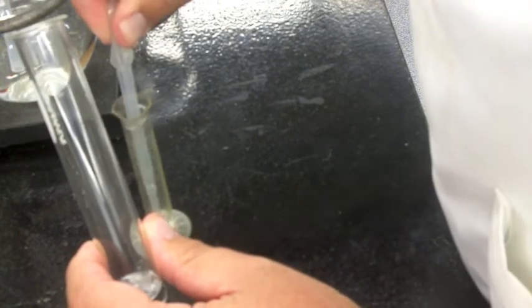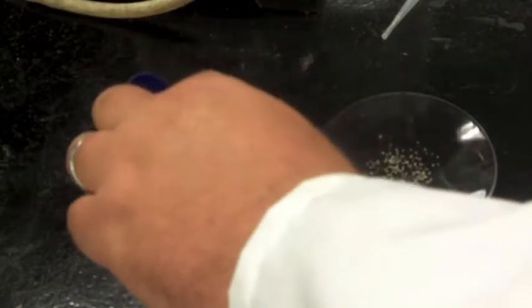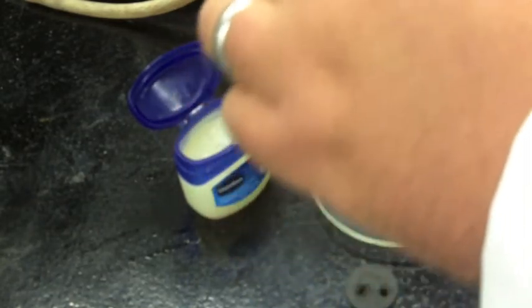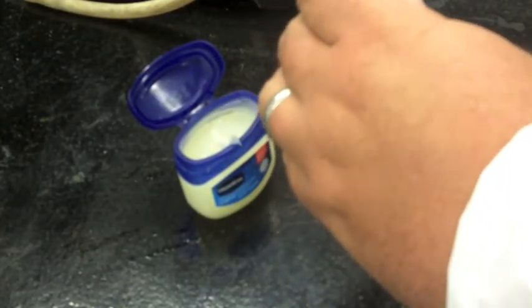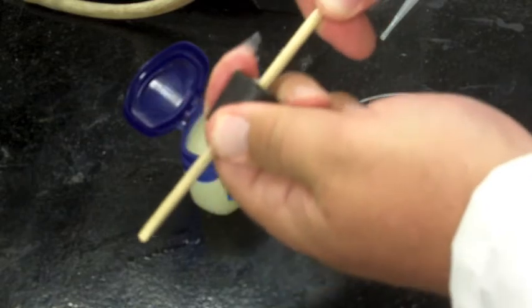Now this is all detailed in the supplemental protocol, but you'll want to get those levels equal, and then there's a little pinch clamp that will allow you to pinch off the tubing. The idea here is we don't want differences in the heights of the water to contribute to the pressure. So we need to have those equal. There'll be a couple of different places, well spelled out in the protocol, where you need to level things, and this is one of them. So get it level, don't break the siphon, keep it underneath the water the whole time, and it should be pretty straightforward.